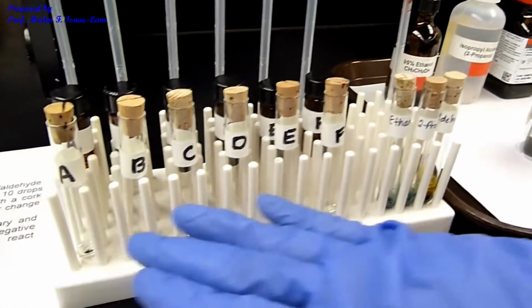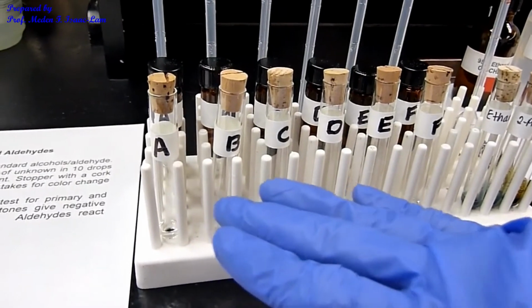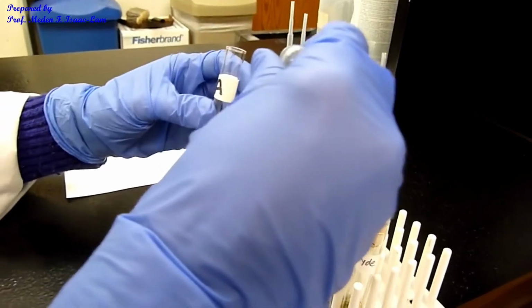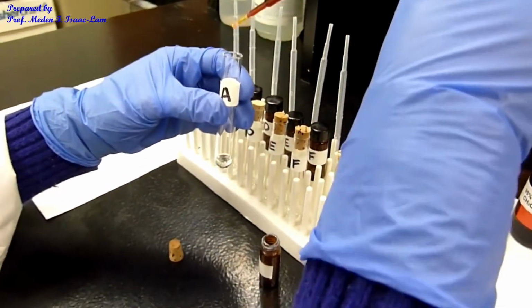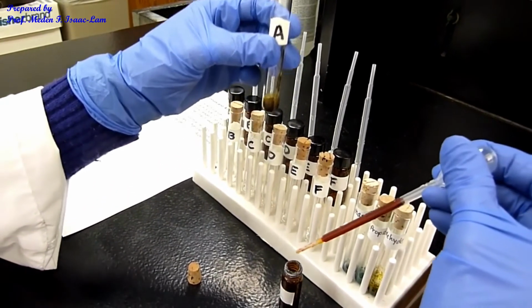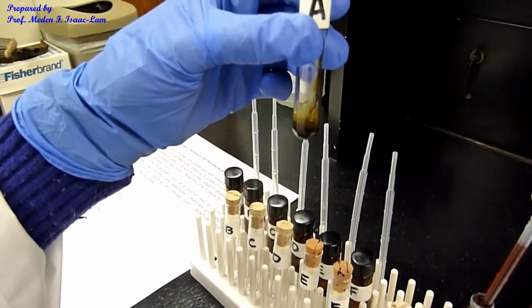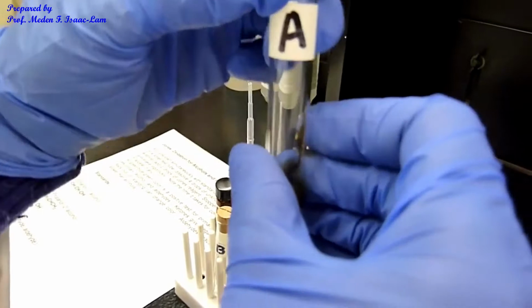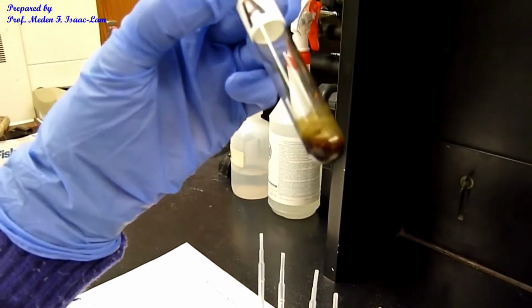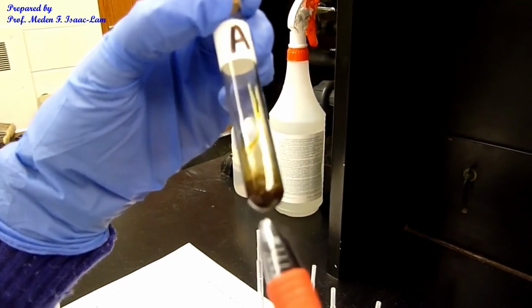So now we are going to check what are the functional groups in each of these unknowns A, B, C, D, E, F. Okay, so 2 drops of the reagent. Okay, you see it bubbling. Okay, so it reacted fast. So it changed. You can see the coloration like dark green on top. So this is unknown A. You can see that greenish color on the side.